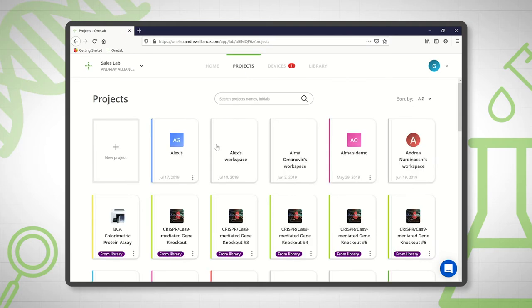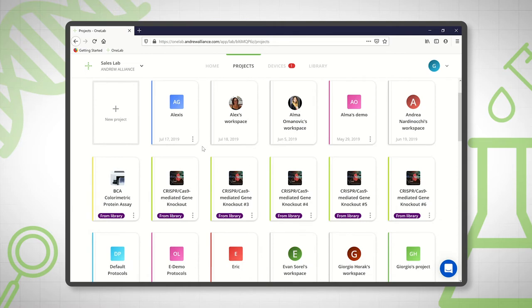Projects is a file, a protocol organization system really. It allows you to collect protocols together and it correlates that with executed experiments.